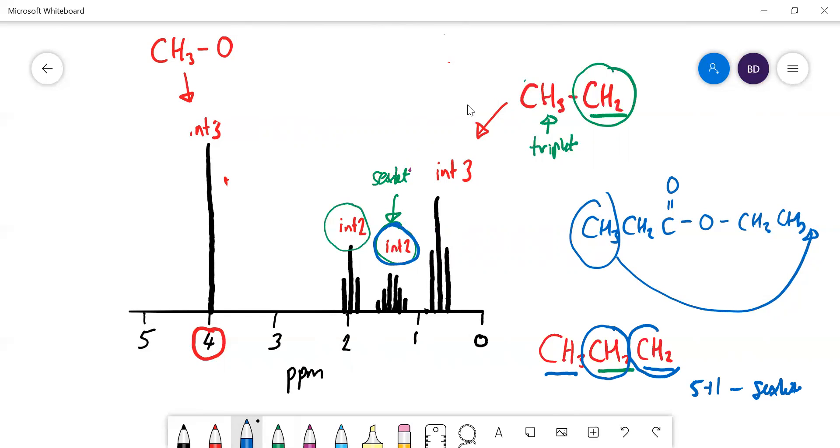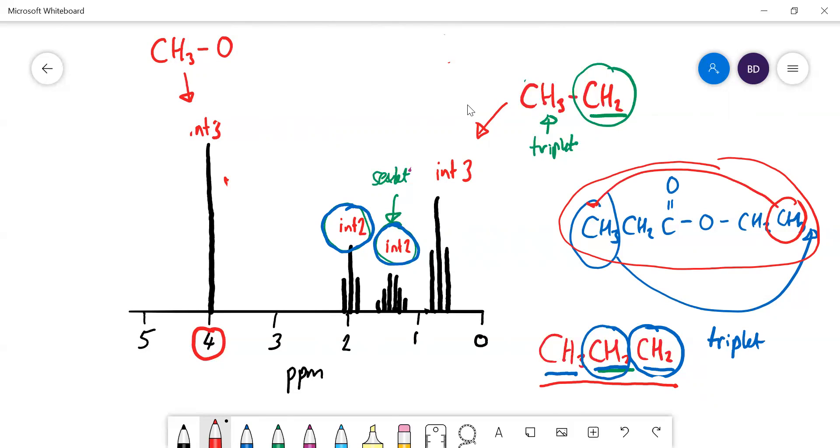Let's see if we can locate this CH2 that's on the other side of it then. We've only got one other integrated value of two there, so it must be that one. And would that be a triplet? Would this be a triplet? Well, it would be, because this carbon here has got two hydrogens on it, N plus one, that would be a triplet. So I think we've got that group there. What I wrote earlier is probably not right because you haven't got the CH3, CH2, CH2 group, a propyl group in here, have you? So I think what we need to do is chop that one off the end there and shove it there.